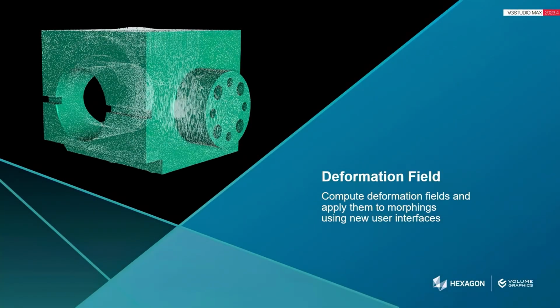Deformation field. Compute deformation fields and apply them to morphings using new user interfaces.